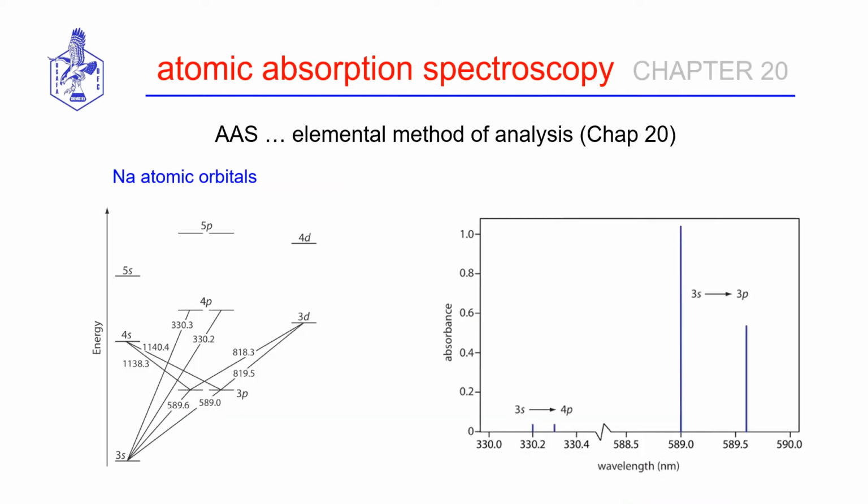So focusing on the ultraviolet and visible spectrum, some of the applications in studying the absorption of light in that region include the technique of atomic absorption spectroscopy, known as AAS. Chemists love acronyms because we don't like to say long phrases. Atomic absorption spectroscopy is going to perturb the atomic energy states of our valence electrons.